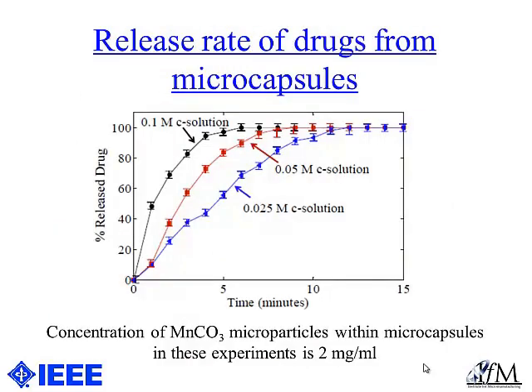Those curves show that by changing the control solution's concentration, we can vary the release rate of this drug model. And as we increase the concentrations of the control solutions, the dissolve time will be reduced from less than 10 minutes to less than 5 minutes.